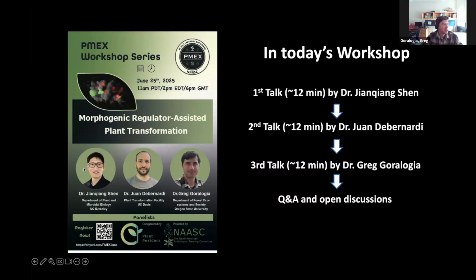But we also noticed that when you change the gene orientation of the auxin and cytokinin genes, it matters. Basically, I think a lot of Agrobacterium are under selective pressure to make the T-DNA smaller because you get increased delivery when you do that. And so that regulon, once it's inserted into plant DNA, you get variation based on position effect, but they're sort of evolved to be in that configuration. So I'm trying not to break it when I do that, or if I am, it had better be intentional. We found some interesting things just by changing the gene order.